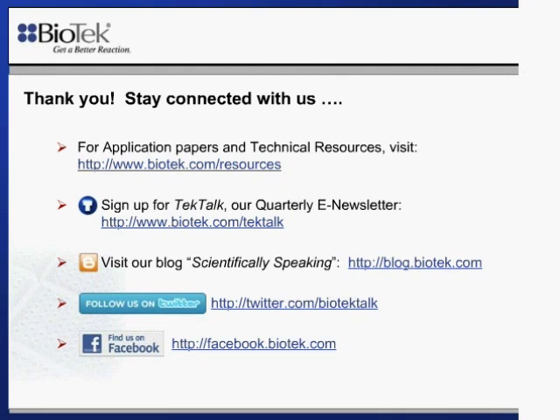Essentially, the software and reader will take measurements at 900 nanometers and 977 nanometers, which is the absorbance peak of water. And then it utilizes that absorbance peak to determine the path length of that sample. So you do not necessarily need to do that on a reference well. You can do it right on your sample well as long as it's aqueous based.